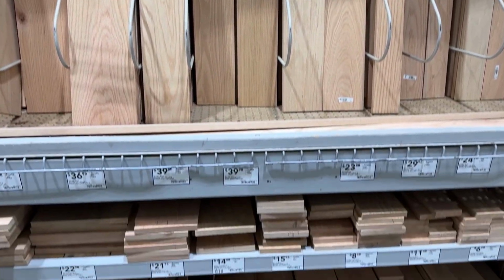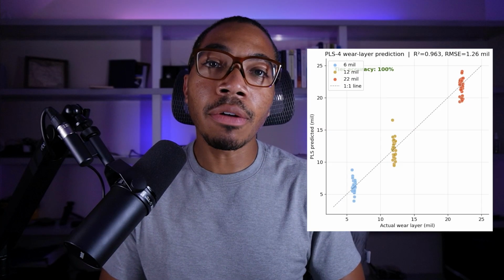So, in today's video, we're going to build a few different models. I'm going to demonstrate that we can actually predict whether we have hardwood or vinyl planks. And we can even build a regression to understand the quality of the vinyl planks just from the data that comes from a NIR. And lastly, I want to demonstrate that we can get greater than 95% accuracy by both predicting the wood type and the vinyl plank quality all in one model.